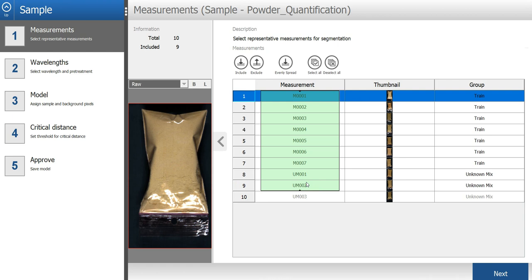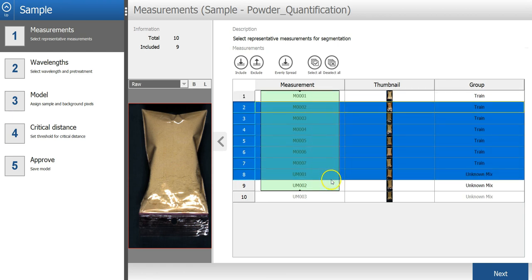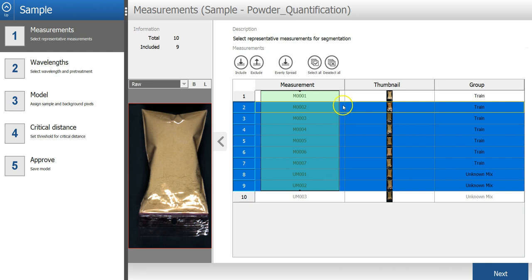In the first step of the sample model wizard, you can select the images that you will use in the model. By default, nine measurements are included, which is okay.